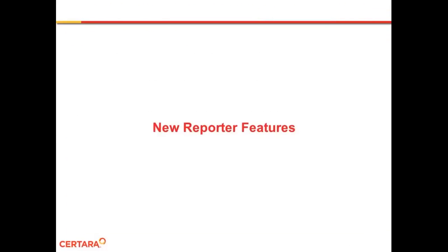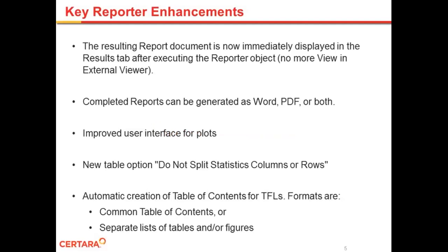So in the first segment, I would like to talk about the new Reporter features. The key enhancements are that the resulting report document is now immediately displayed in the Results tab after running the Reporter object. So no longer do you have to go to a View an External Viewer menu. The completed reports can be generated as Word, PDF, or both.